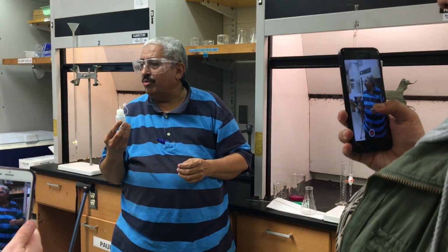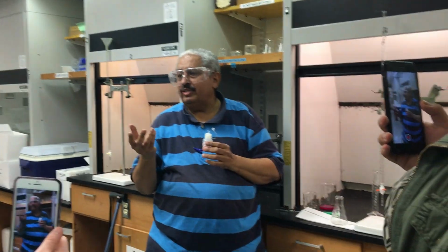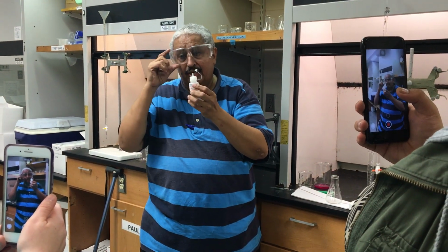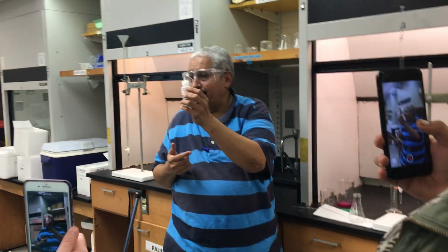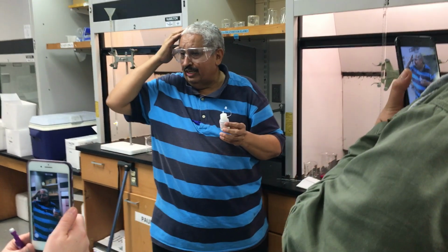Indicators are organic compounds that help us to visualize the acidic medium from the basic medium. I can tell with the help of this if I have an acid or a base. Now, if I have an acid, it will be colorless. If I have a base, it will be what? Pink. And this is similar to the organic dye you put in your hair, correct?